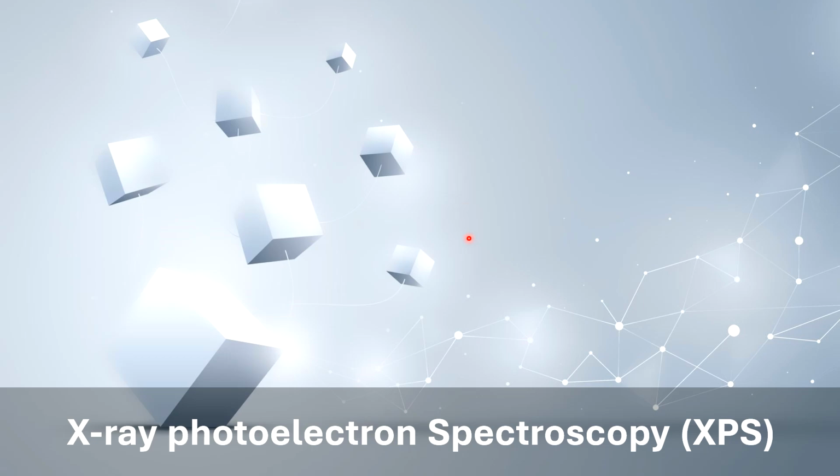X-ray photoelectron spectroscopy, abbreviated as XPS. This is a very basic video in which we will see how we can estimate the prepared material structure on the basis of the XPS.